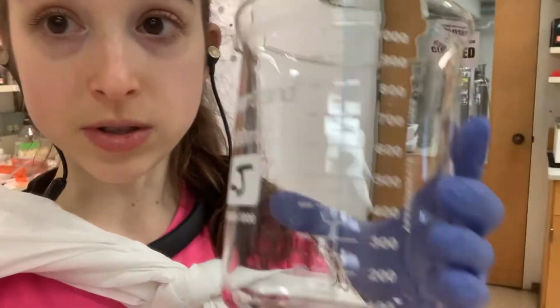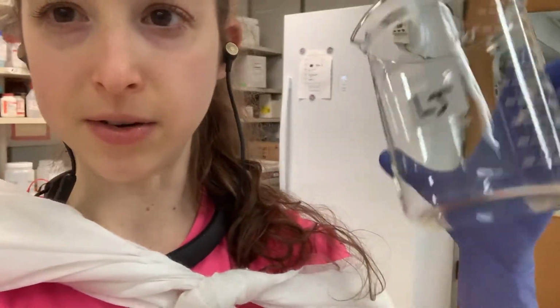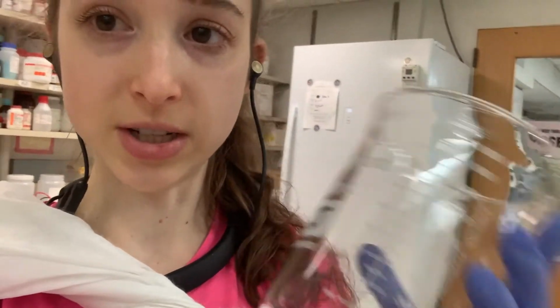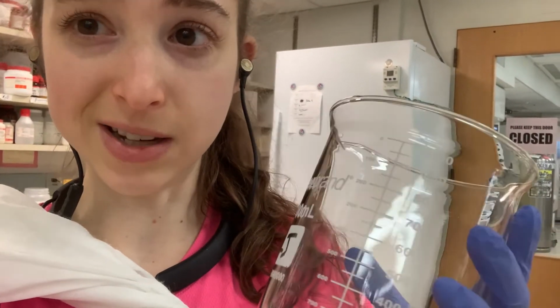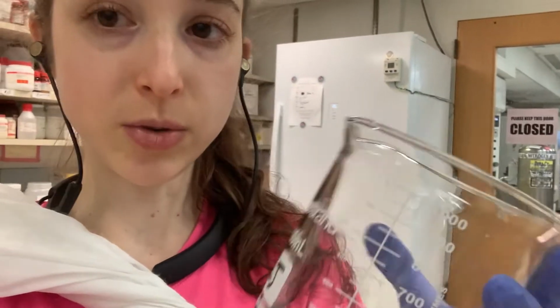So you dissolve your solids in here, or if you're mixing different liquids or whatever. But basically you're going to want to leave room to adjust the pH. Even if you try to calculate beforehand the right amounts of the various solids you would need, it's probably going to be a little off. And so you're going to want to adjust the pH, so you want to leave room to do that.